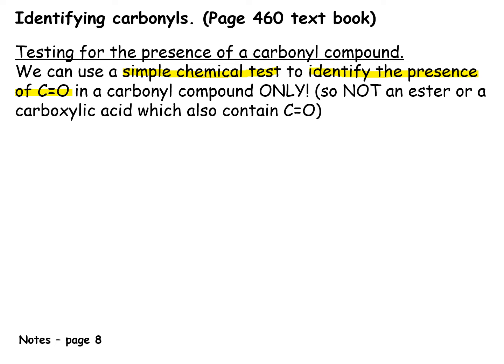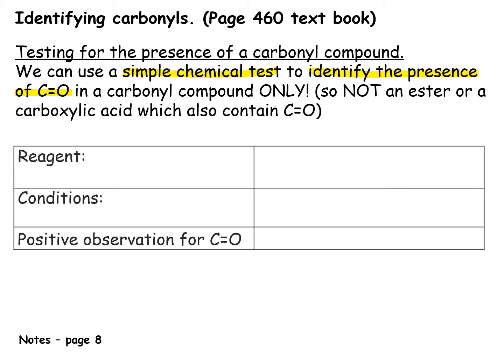So this test won't detect the C double bond O's in other functional groups such as the ester or the carboxylic acid. So if you have some chemicals and they're unknowns and you suspect that it could be an aldehyde or a ketone, or you're wondering whether it is or not, you need to rule it out, then you can use this simple chemical test to detect them, okay, detect the presence.